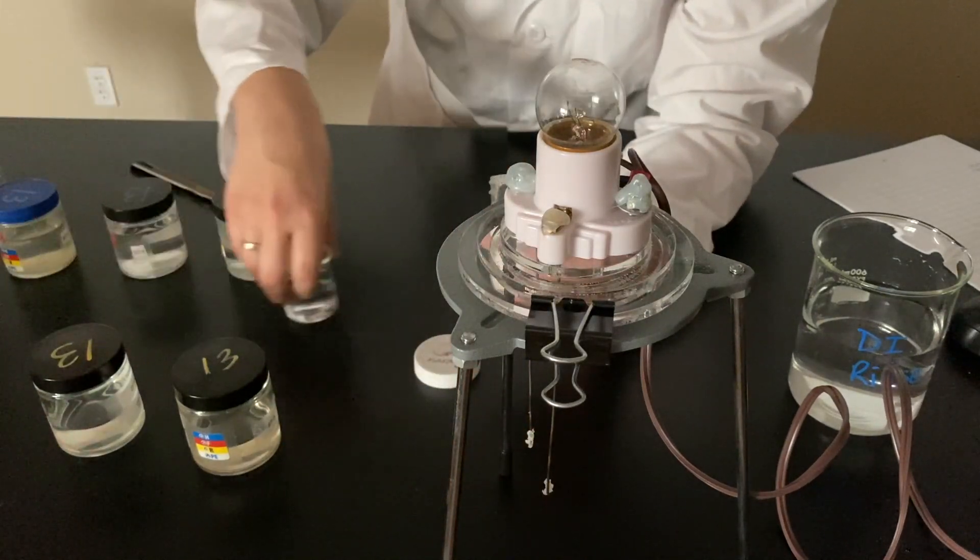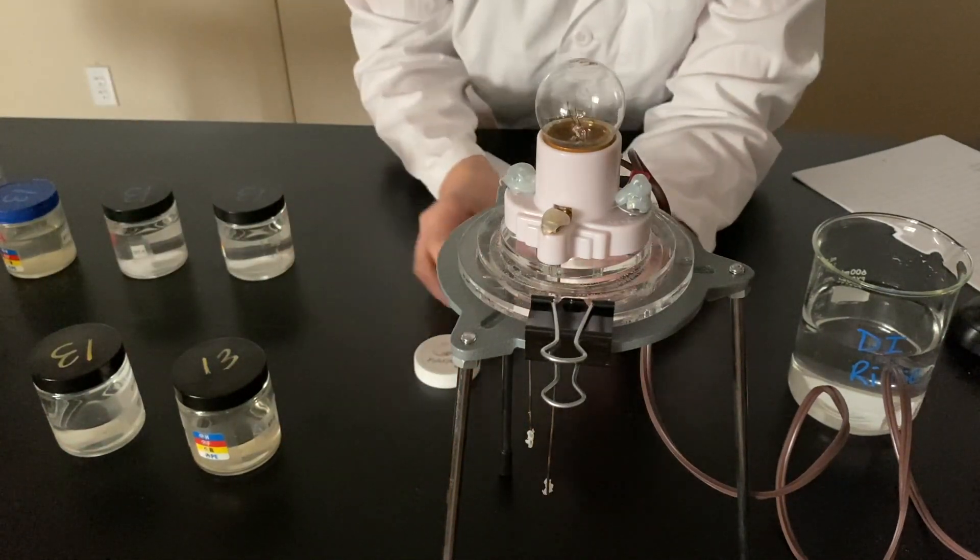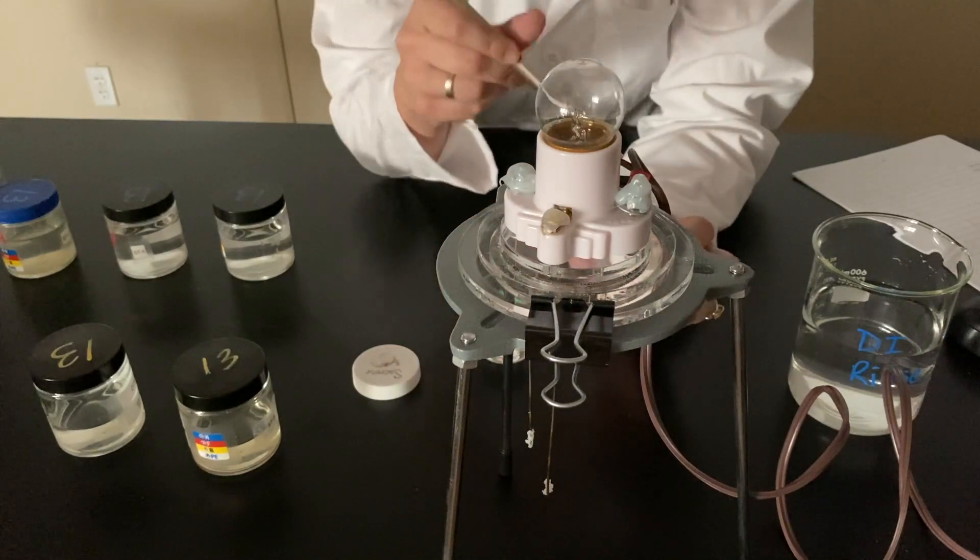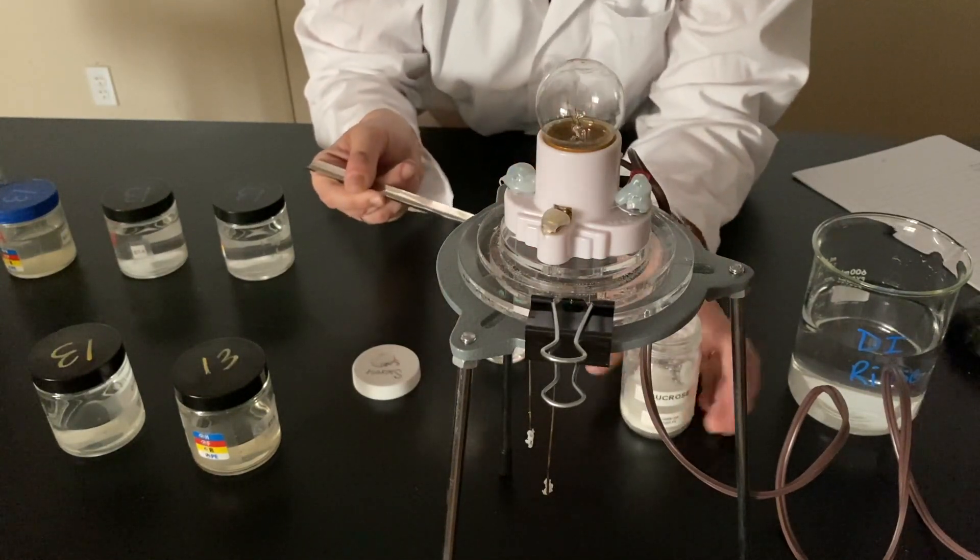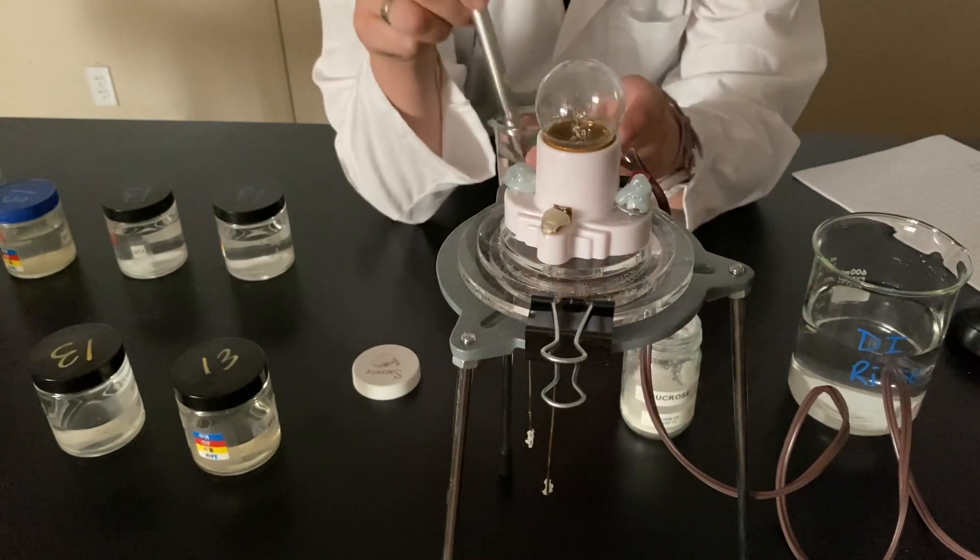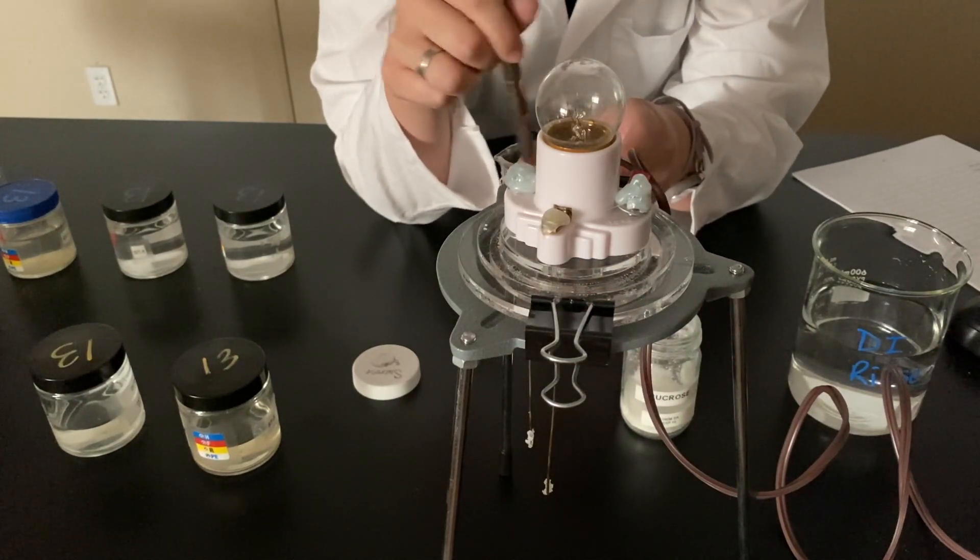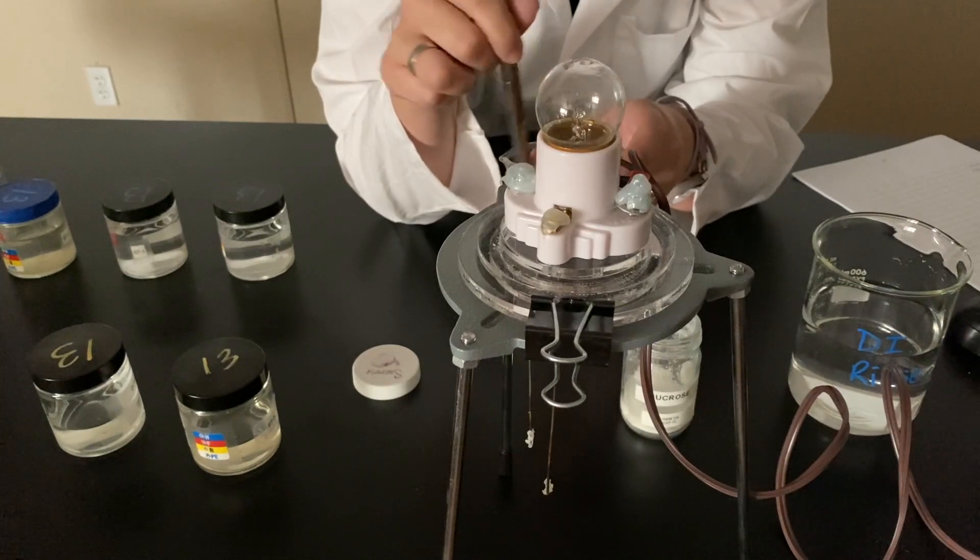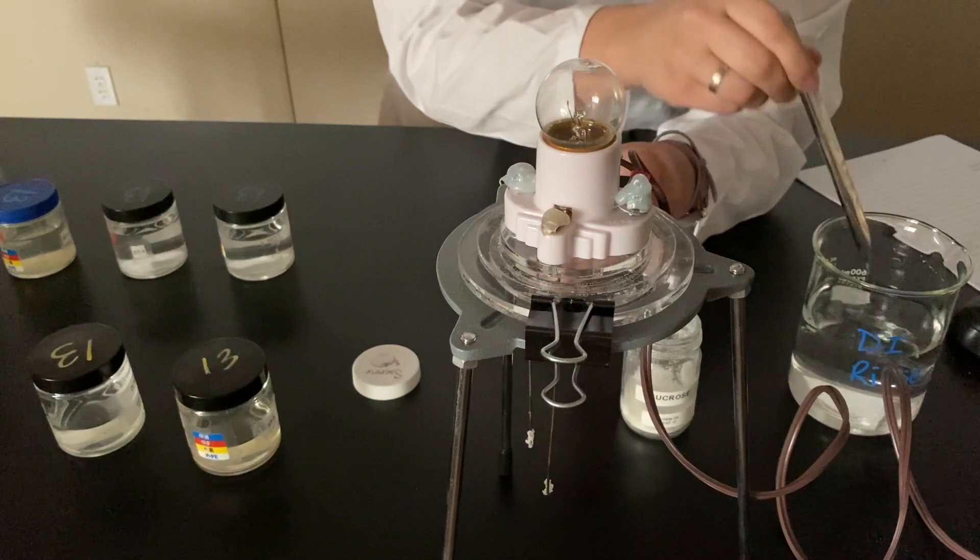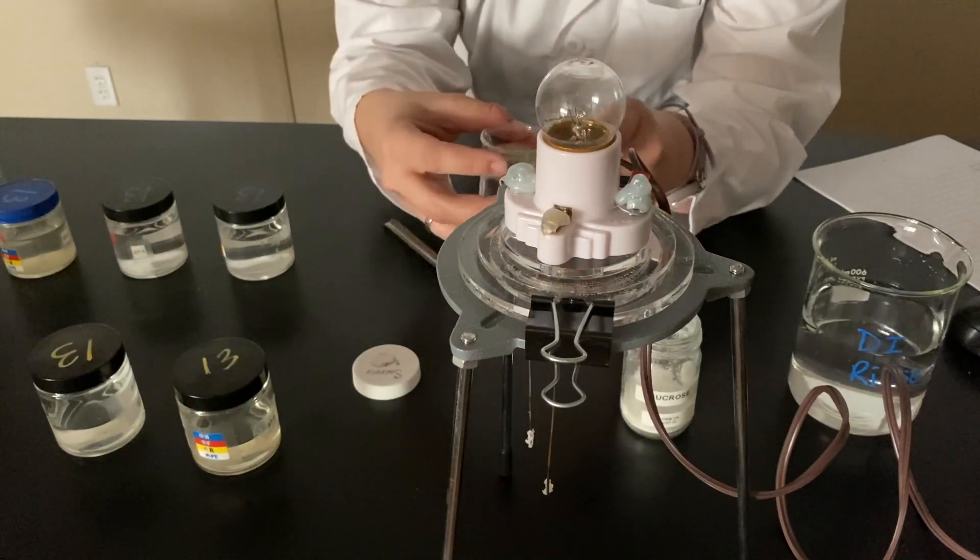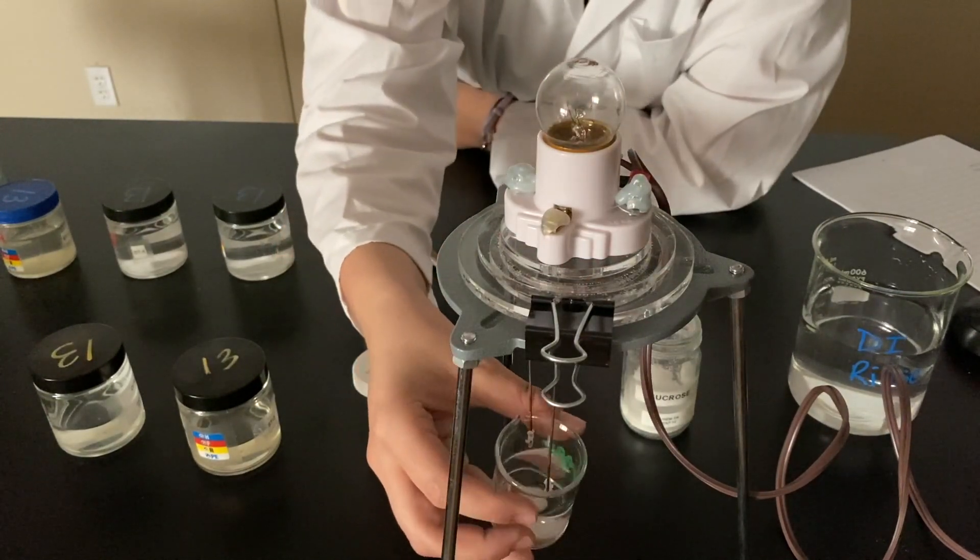Then we're going to test sugar aqueous. So that means I'm going to make a sugar solution here. I'm going to dump some sugar in some DI water. Mix it up. Rinse that off. And we'll see what happens now with the sugar water.